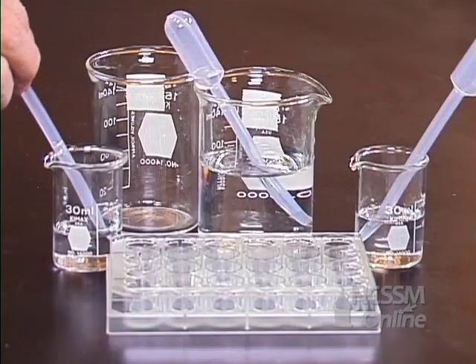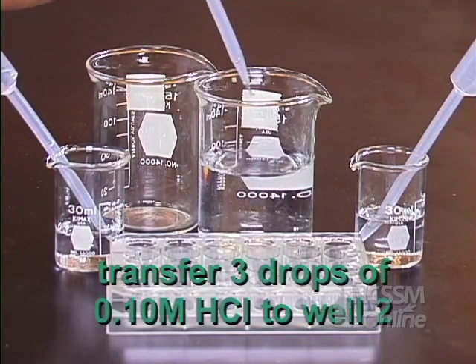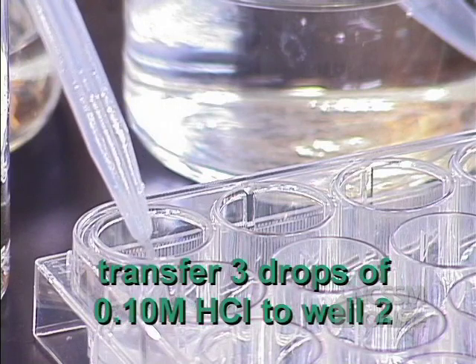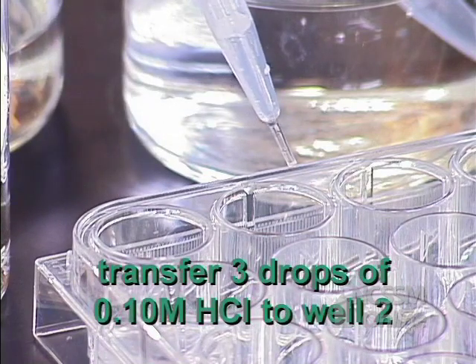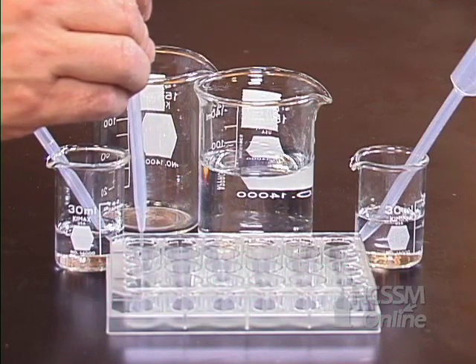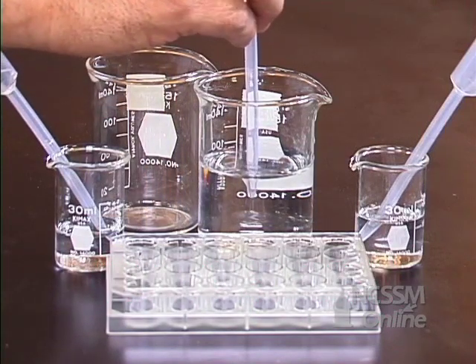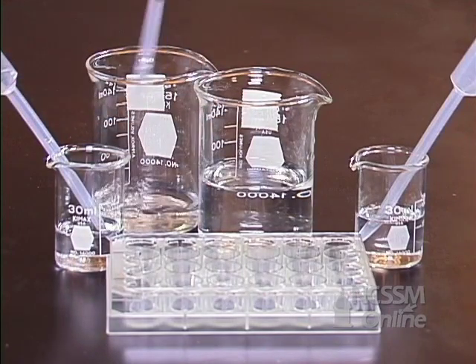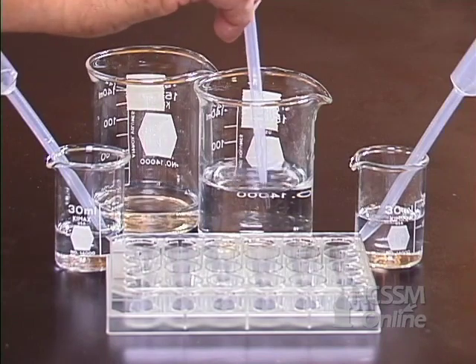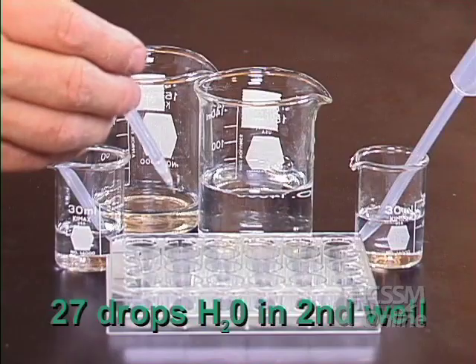Take your water dropper and transfer 3 drops of the solution from well 1 to well 2. Now rinse your dropper several times with water and empty it into your waste beaker. Add 27 drops of water to the second well.